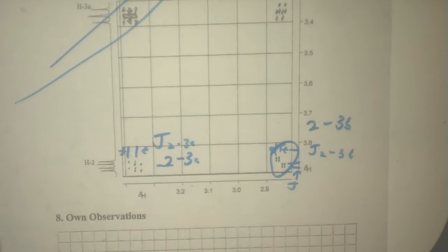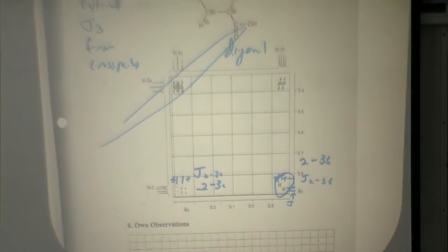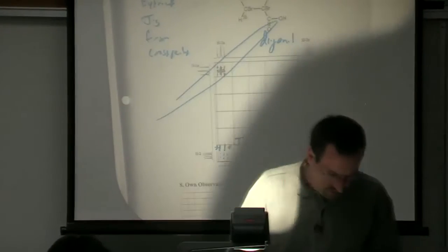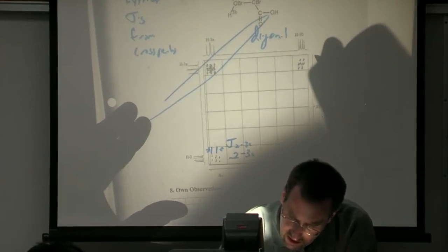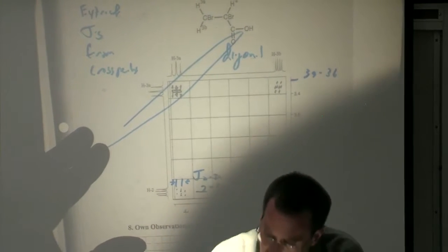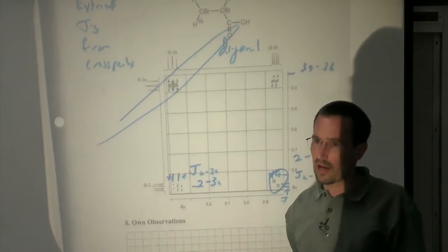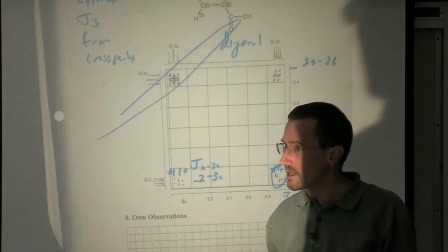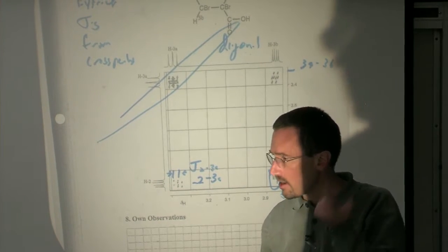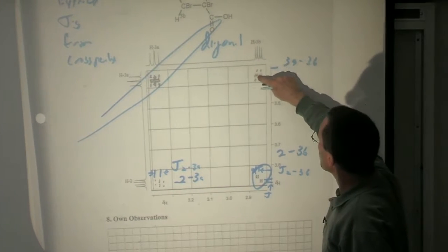And if you're looking and trying to assign some stereochemistry based on this, then it can be a very valuable tool to add on. Here we see the 3A to 3B coupling. And of course, this is the one that's going to have the biggest coupling because that has your geminal coupling. Geminal couplings are generally bigger, not always because they're highly variable based on hybridization, but on sp3 carbons, they're generally the biggest. And so now you see our overlapping squares here.